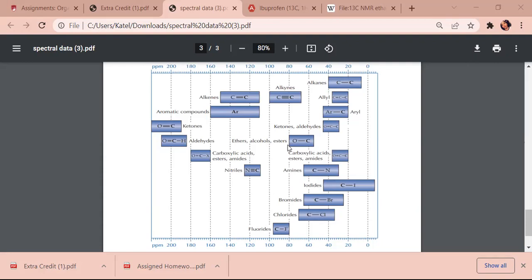So again, if you look at this and imagine there was a CH3 right here and a CH3 right here, then if you were to flip that molecule and the CH3 actually moved over here and this CH3 moved over here, again, there would be no difference, which is why there's not a real difference in those two molecules. So now we're going to move on to signal location.